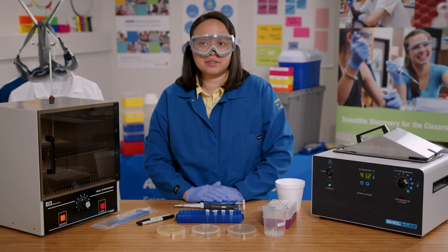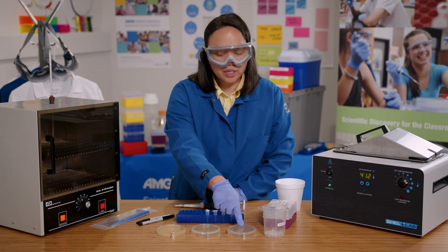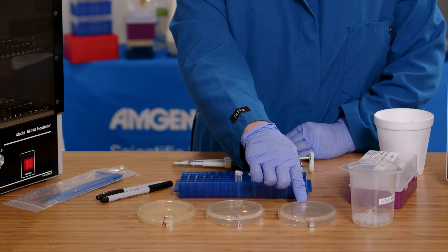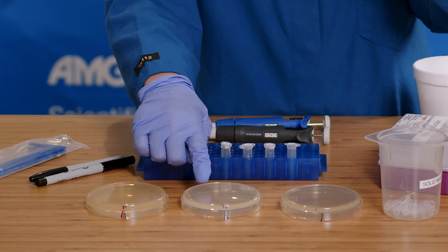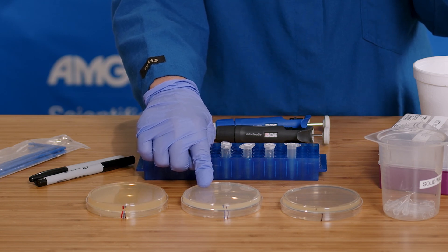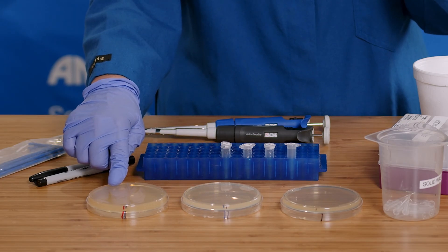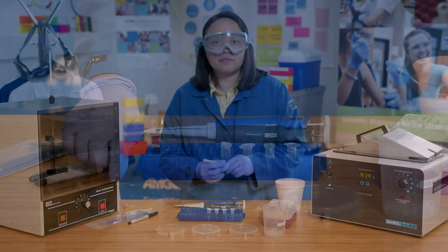Now I'm going to plate the bacteria. For this lab, there are three different plates. The plate with one stripe has just LB and has the nutrients the bacteria need to grow. The plate with two stripes has LB and ampicillin — the ampicillin should prevent the growth of any bacteria that don't have the ampicillin resistance gene. The plate with three stripes has LB, ampicillin, and arabinose. The arabinose is needed for the red fluorescent protein to be expressed.